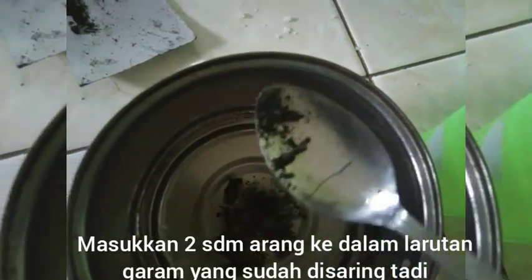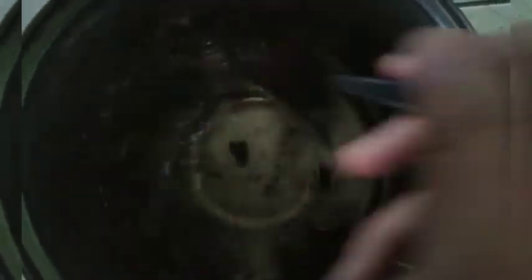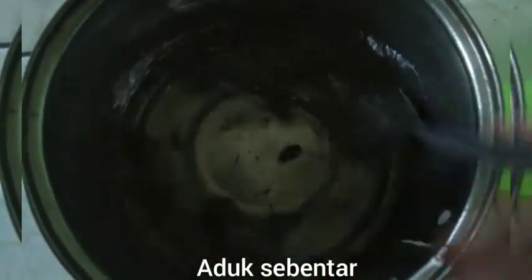Put 2 tablespoons of charcoal into the filtered solution and stir it.